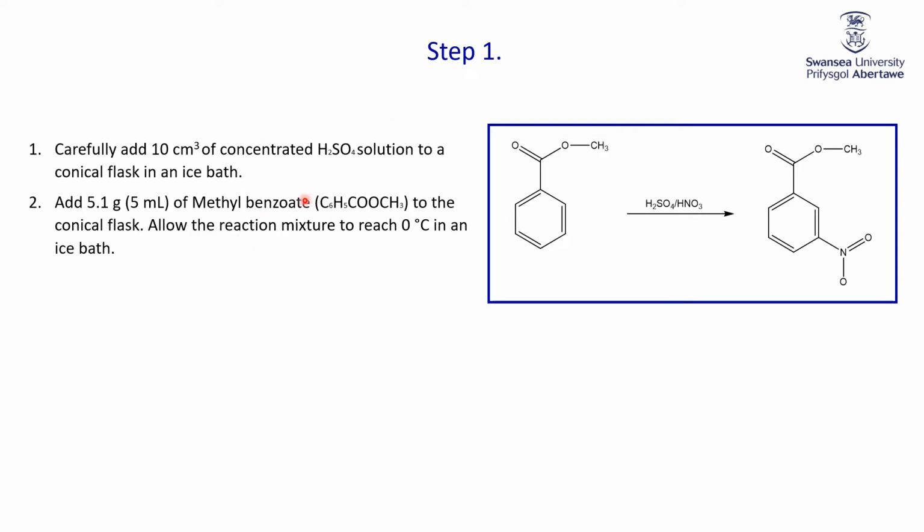Now, at this stage, one of the issues with organic chemistry, especially when you have molecules with more than one functional group, is you can have competing reactions. What we have here is already an ester group with some acid, and an ester group with acid can be hydrolyzed using the acid catalyst instead of the base catalyst that you're going to use. And you can see here we'd be hydrolyzing the ester to the acid. Now, this acid here, benzoic acid, doesn't really react very well, and so if you just had benzoic acid and tried to nitrate it, you would have a very hard time doing it. So what we want is, we do not want this, we want this. If your solution goes pink at this stage, no big deal, because this is a reversible reaction.